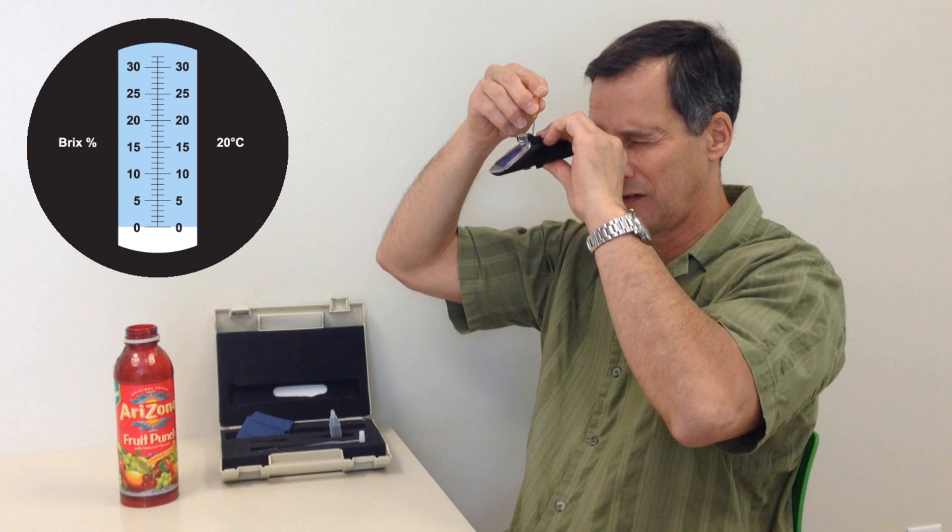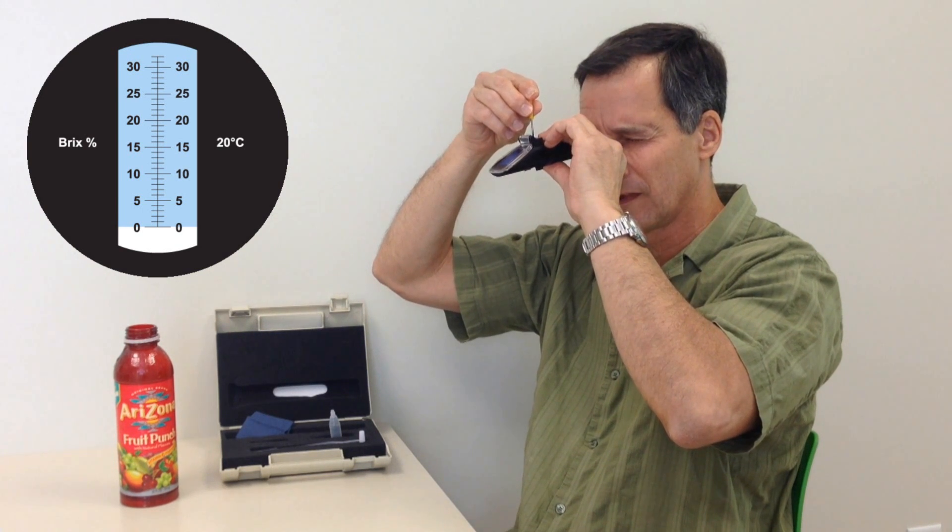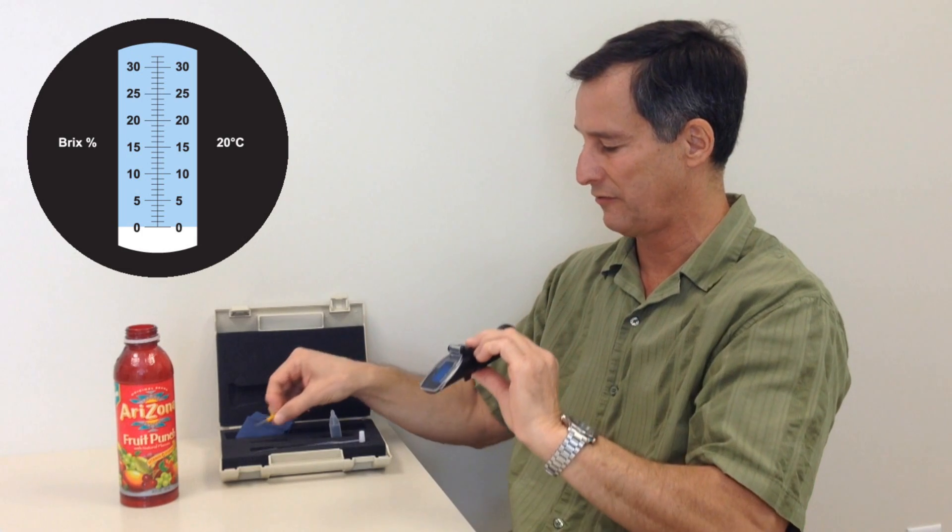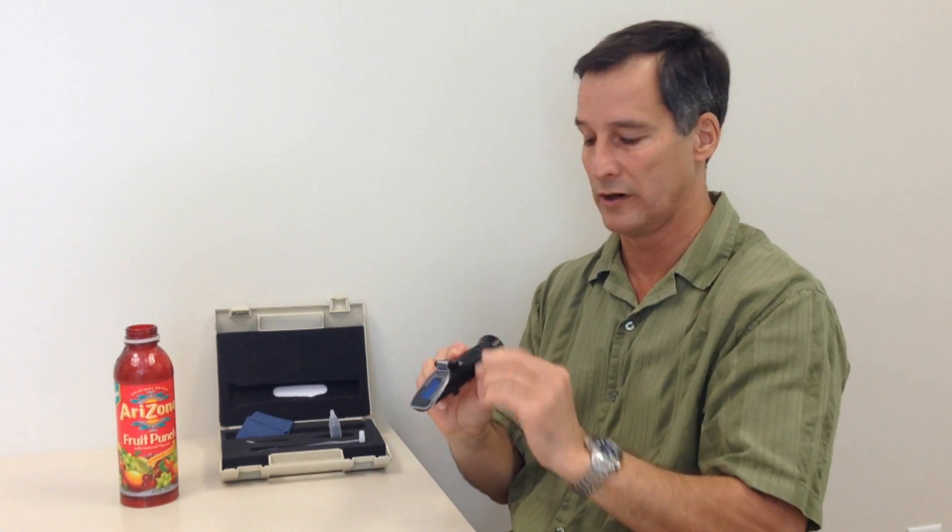If it's not on zero, we turn this screw until it's exactly on zero. Now I've calibrated the refractometer to zero at distilled water.